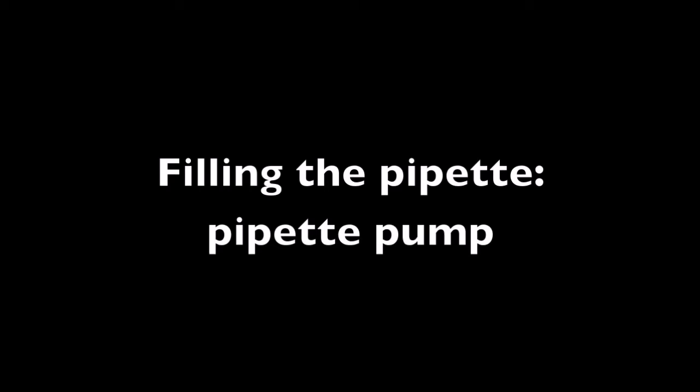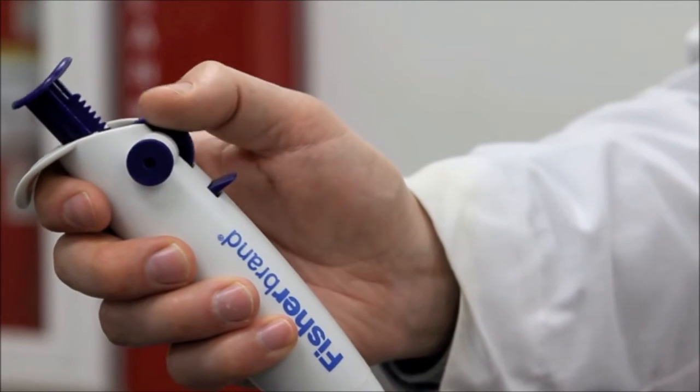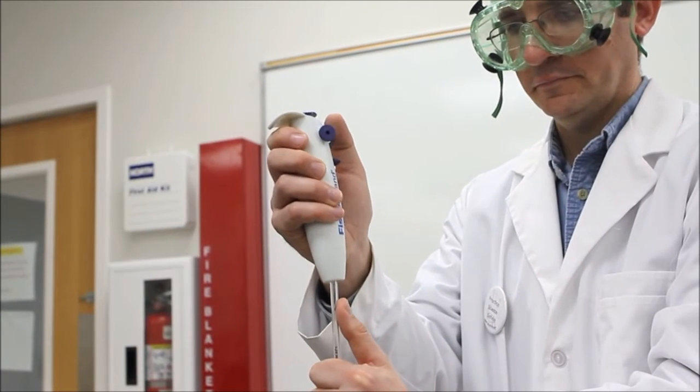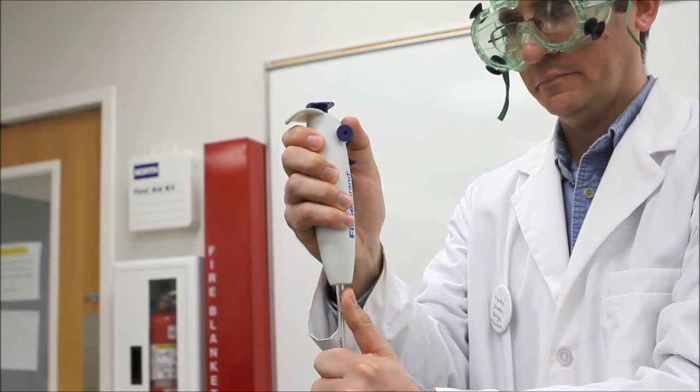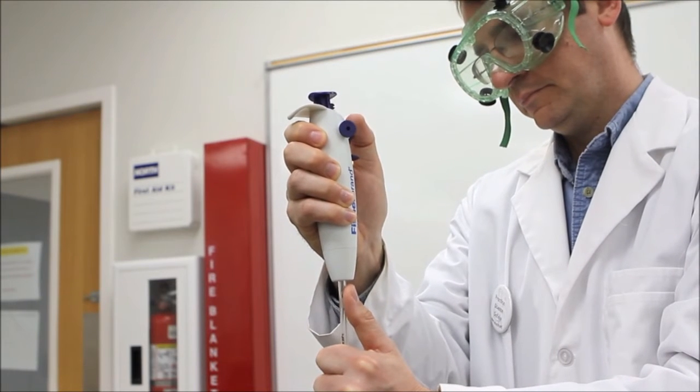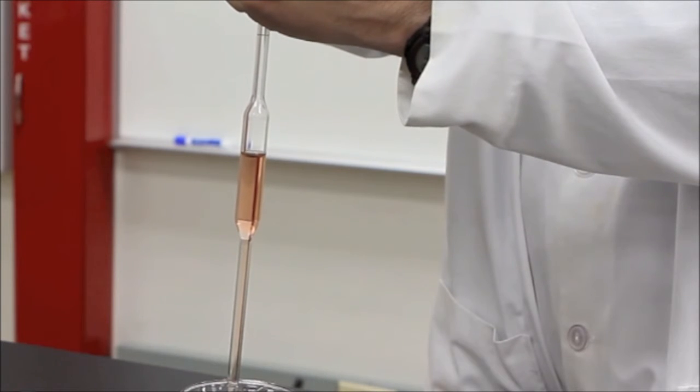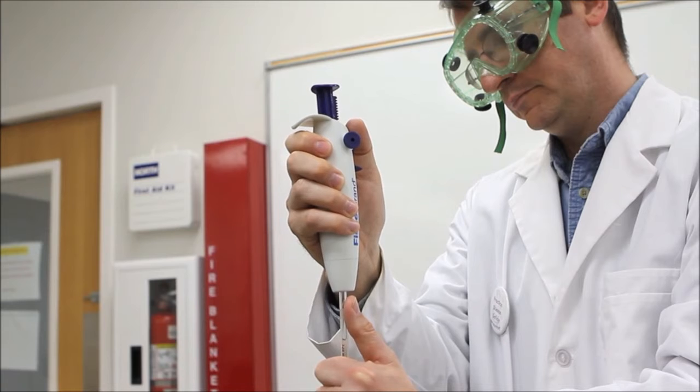The first of two common suction devices used in our labs to fill the pipette is the pipette pump. Turning its wheel moves the piston up, providing controlled suction of the liquid into the pipette. With the pipette pump snugly fitted to the mouth of the pipette and its tip immersed in a container of your solution, slowly turn the wheel, progressively filling the pipette until the liquid level is an inch or two above the etch mark, but well below the mouth of the pipette.